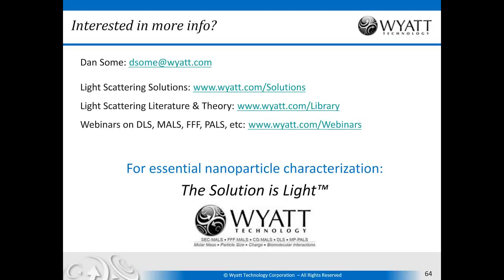So those are good ways. You do the separation and characterize each one individually. You can use downstream of FFF and SEC not only the standard light scattering detectors, you can use concentration detectors, you can add in an online fluorescence detector. So there are many types of characterization tools that you can apply once you've done that initial separation.